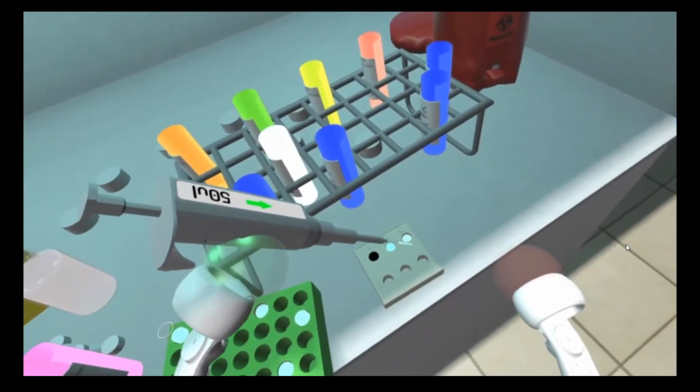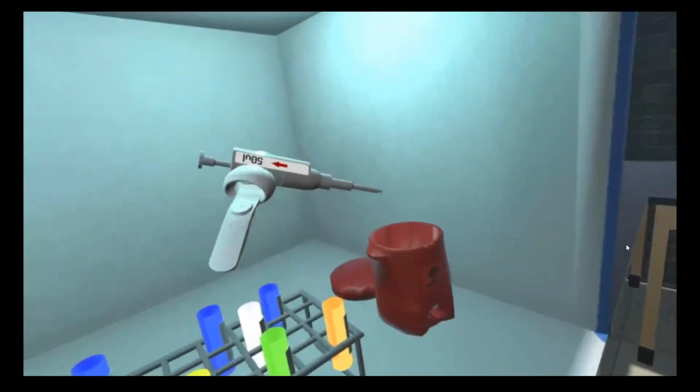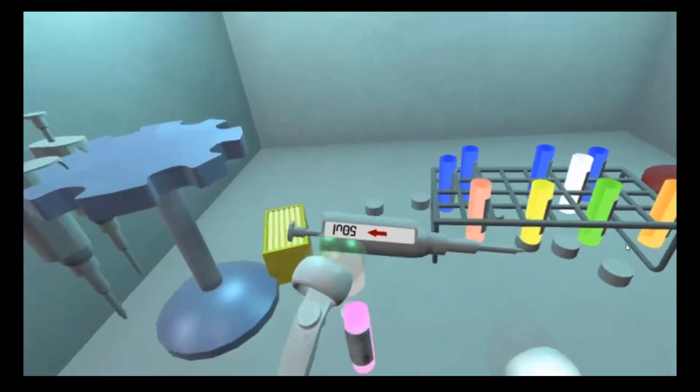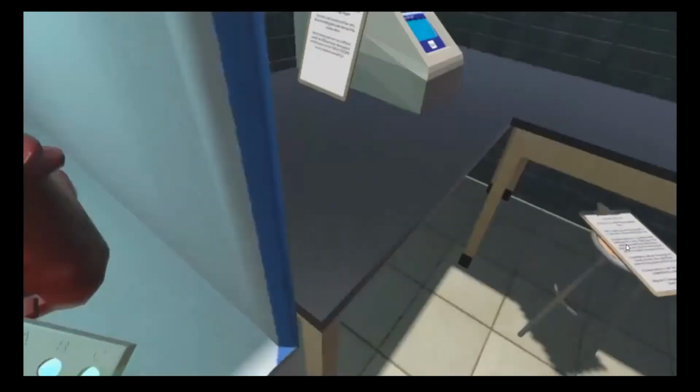They will prepare the saliva samples with proteinase and vortex the samples just as a lab technician would. They will then also use reactants such as gene probes and PCR master mix to prepare the PCR mix solution that will be added to the saliva sample.